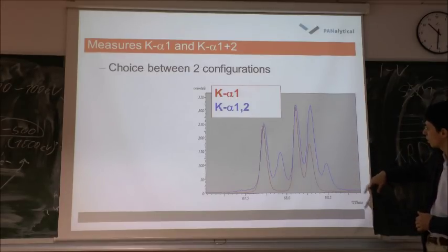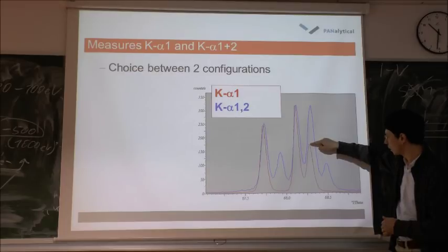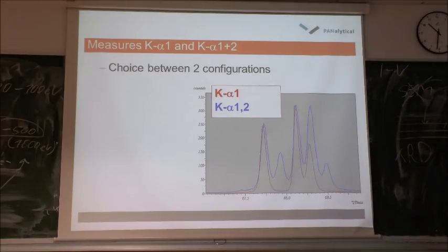So basically, why is it so? Because this is producing another peak for K alpha 2, and then the material also has a peak on this position. So basically, this is doubled, yeah? And this is just K alpha 2. So if you want to see the symmetry of your sample, then it can be pretty much complicated if you work with both wavelengths.